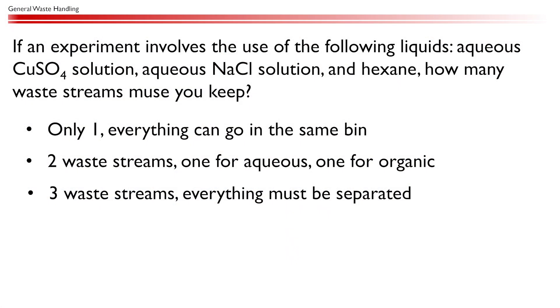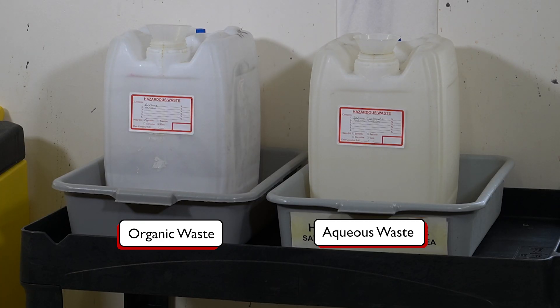If an experiment involves the use of the following liquids: aqueous copper sulfate solution, aqueous sodium chloride solution, and hexane, how many waste streams must you keep? The answer is two waste streams. Aqueous copper sulfate and sodium chloride solution can be disposed of together in the aqueous waste. However, hexane, an organic solvent, should be disposed of separately in the organic waste.